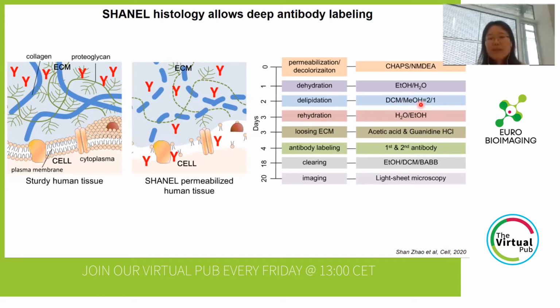Very obviously, the delipidation step tries to get rid of the lipids on the plasma membrane of the cells.